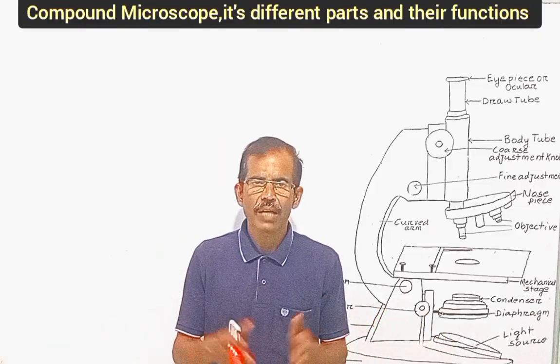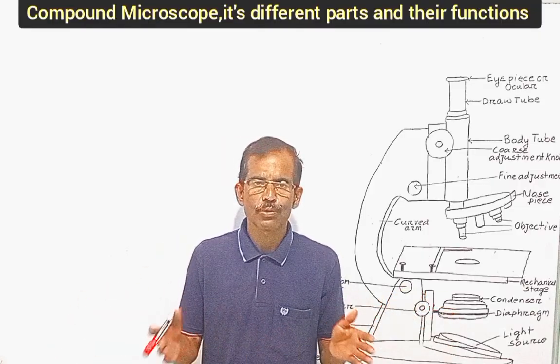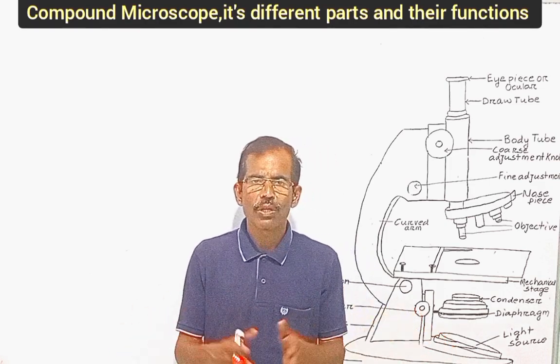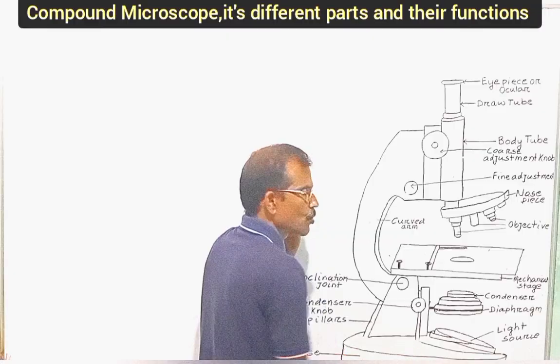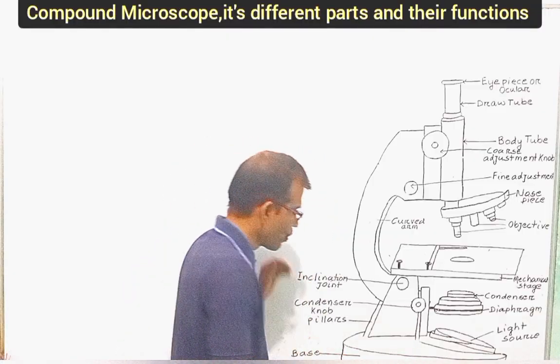There are different types of compound microscopes such as bright field microscope, dark field microscope, inverted microscope, fluorescence microscope and phase contrast microscope. This figure illustrates the different parts of a compound microscope.